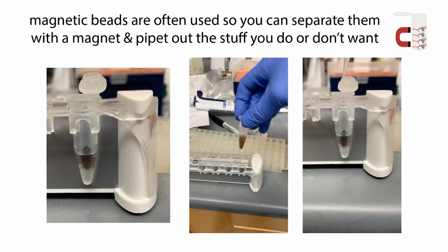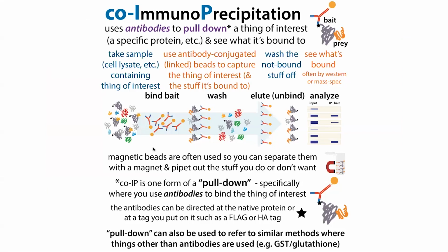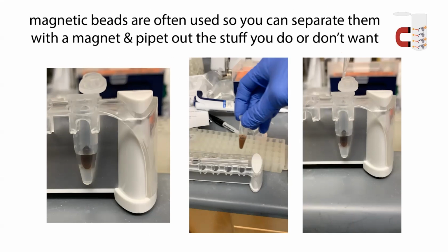You pipette out the liquid, which should be the bulk of whatever wasn't bound. But it's not going to be all of it, and there's still going to be some non-specifically bound material, so you do several wash steps. Basically, you mix your sample with some wash buffer, isolate your beads again, suck out the liquid, and do that a few times.